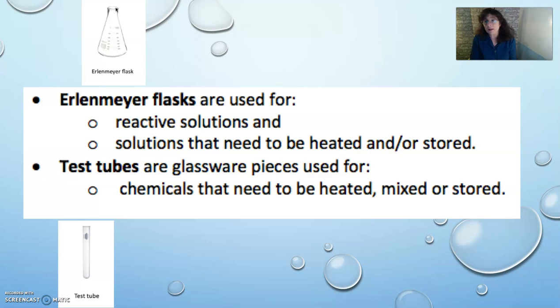So I love Erlenmeyer flasks. Use them for a lot of things. They're good for rough estimates as well. And they are good for many different things. Reactive solutions, solutions that need to be heated, solutions that need to be stored.